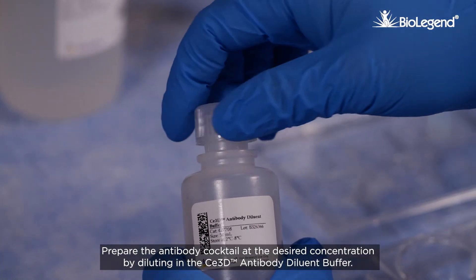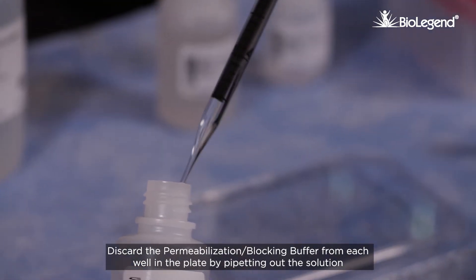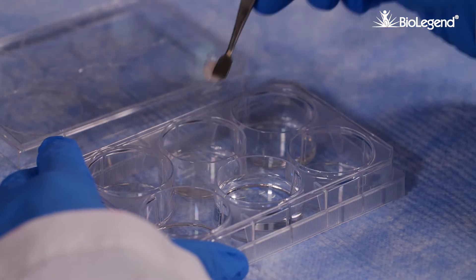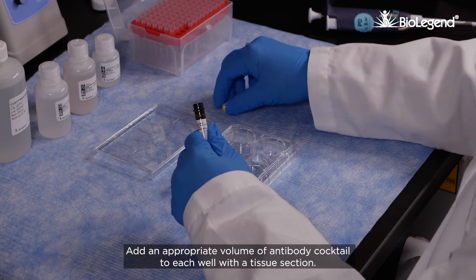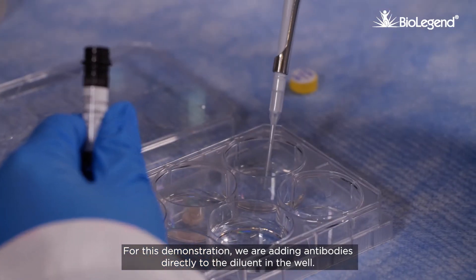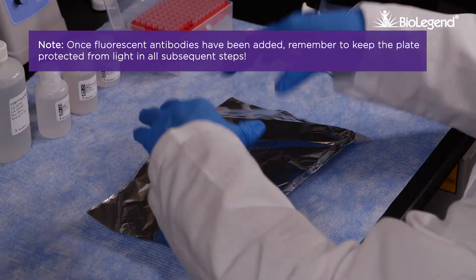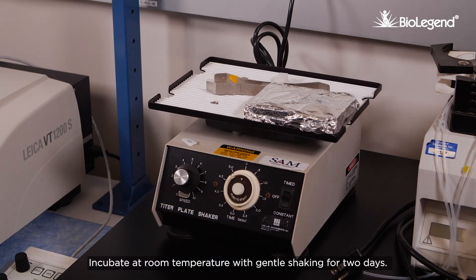Prepare the antibody cocktail at the desired concentration by diluting in the C3D antibody diluent buffer. Discard the permeabilization blocking buffer from each well in the plate by pipetting out the solution or transferring the tissue section to a new well. Add an appropriate volume of antibody cocktail to each well with a tissue section. For this demonstration, we are adding antibodies directly to the diluent in the well. Incubate at room temperature with gentle shaking for two days.